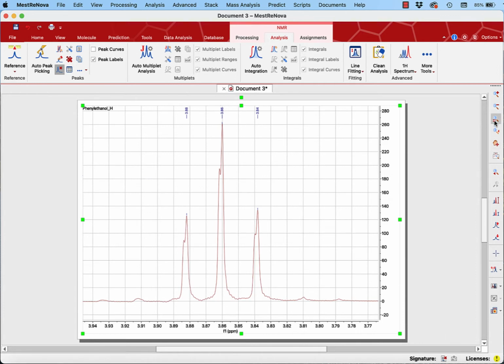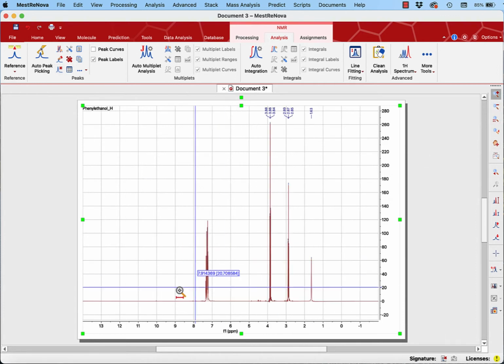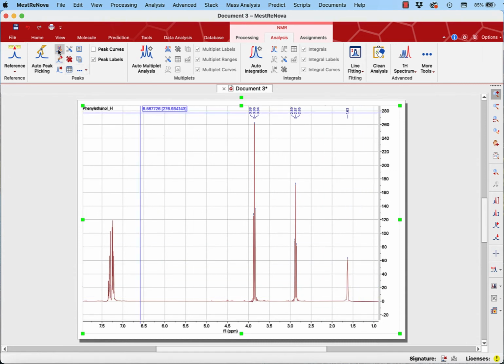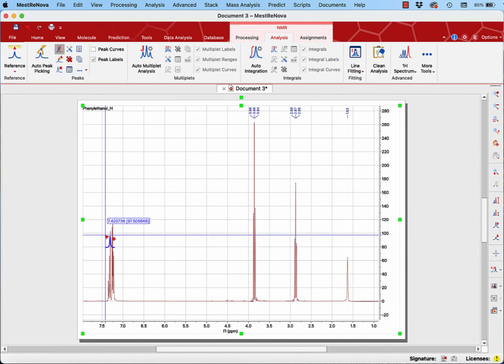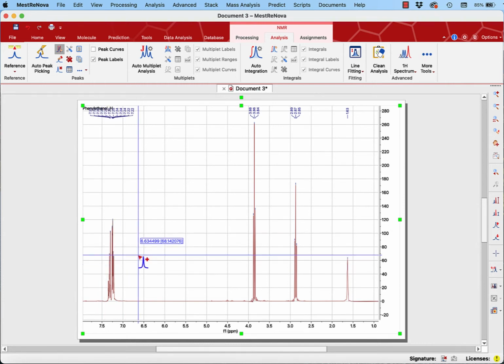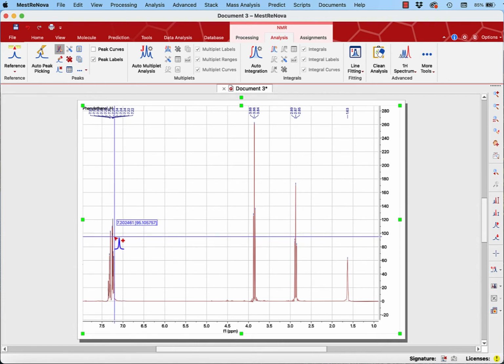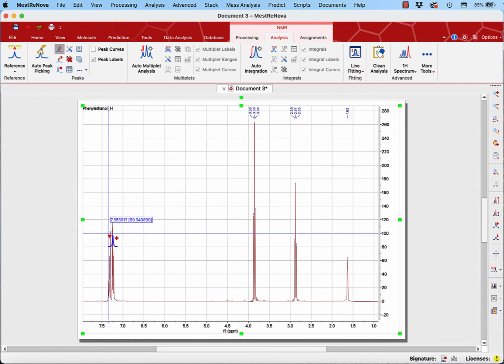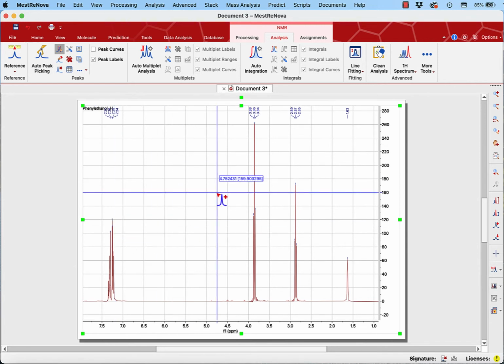Okay, let's do full spectrum again, and we'll zoom in on our area. Looks good. I'm going to go back and do the aromatic stuff over here. If I go too low, I'm going to get a lot of signals. Whoa, that's quite a bit. I'm not going to need to know all of those, am I? So I'm going to go back and raise it up a bit higher and only mark a few, because at least then I'll know where the numbers are showing up.